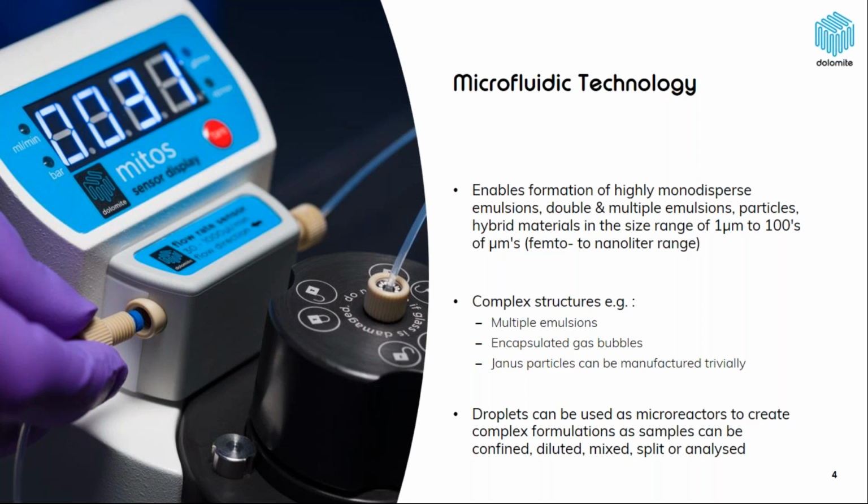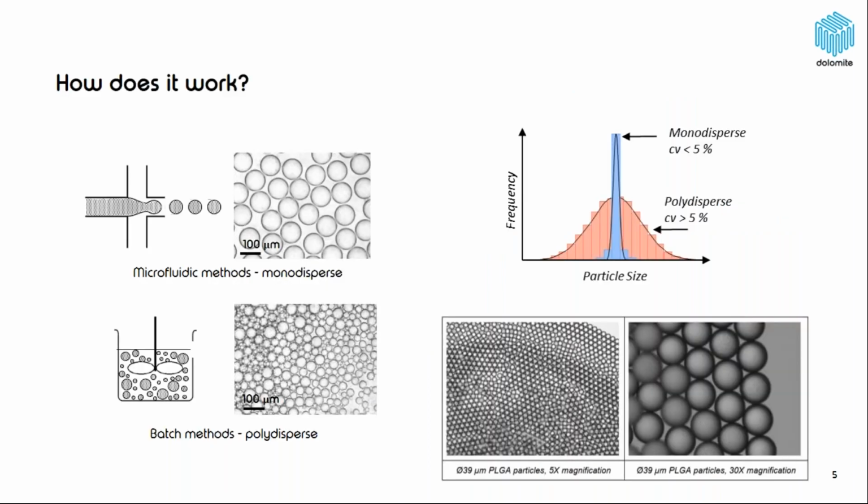As you can see on the slide, it goes through a flow sensor, and the software that we use has the capability of chasing a specific flow rate set to within 1 millibar pressure of the pump. You then flow in through droplet microfluidic channels into a chip, which you image directly, and based on that, you can create your droplets, nanoparticles, etc.